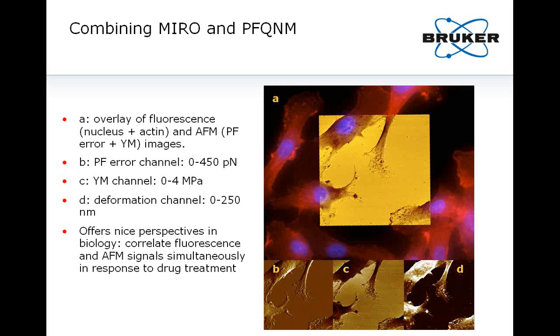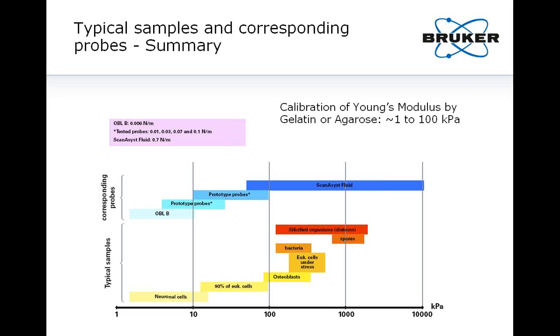A possible application could be, for instance, to add a drug to the dish and probe in real time the effects in the optics and correlate this with specific mechanical properties. Okay, I have to move ahead because we have only 12 minutes left.